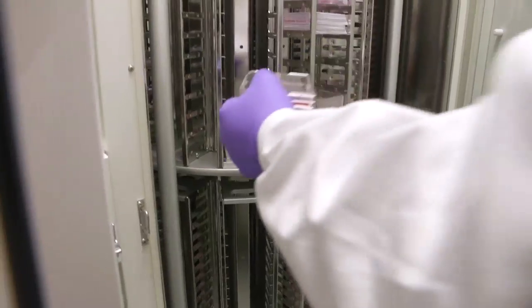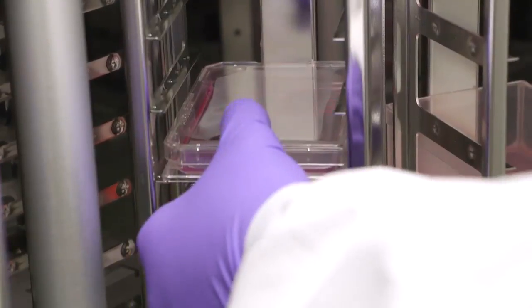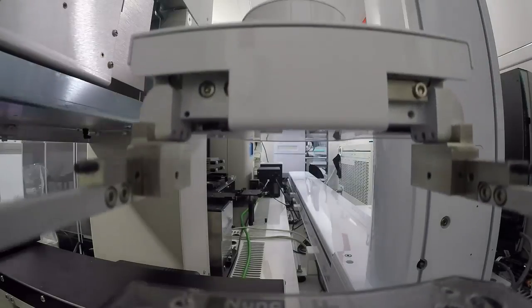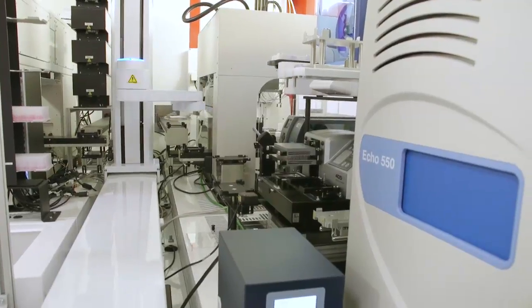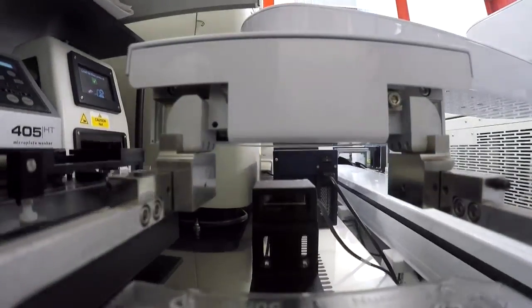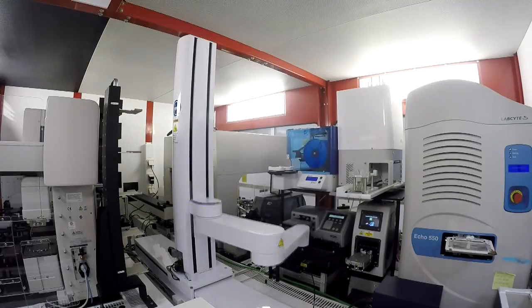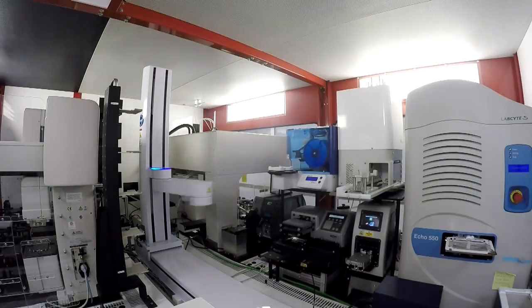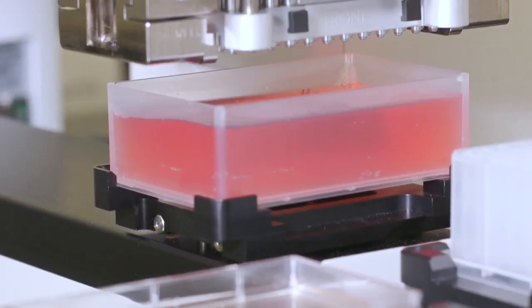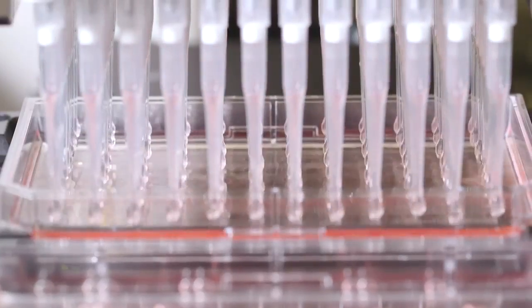The LCSB has installed a worldwide unique, fully automated system for this very purpose. Latest generation robotics allow a whole library of drugs to be analyzed simultaneously with much greater precision than by conventional laboratory techniques. This is important progress because despite intensive research, only few successes have been recorded over the past decades in drug development for Parkinson's disease.